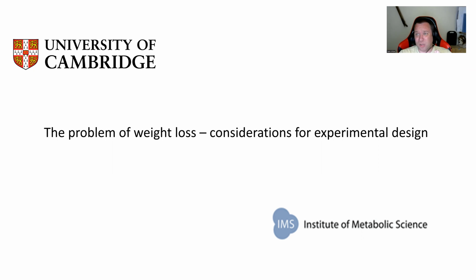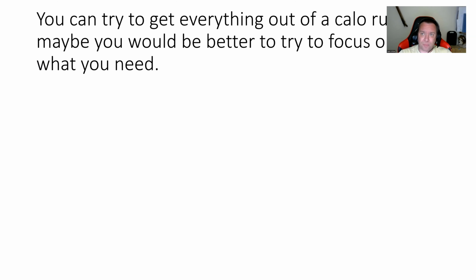And you want to know whether your energy expenditure data is reliable and whether that negative energy balance is impacting on it. And I'm going to show you some data and a couple of examples of how we dealt with that, and also some other considerations you may have when designing your calorimetry experiments, depending on what you're trying to get.